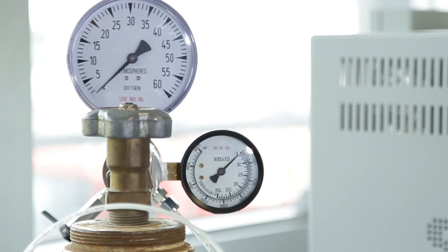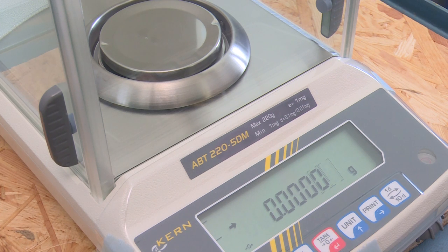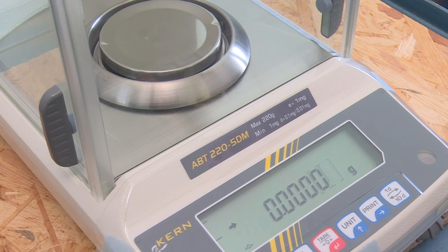The ancillary pressure equipment consists of a pressure regulator to control the filling of the bomb with oxygen, a pressure gauge to indicate the pressure in the bomb, and a relief valve or bursting disk operating at 3.5 MPa and installed in the filling line to prevent overfilling the bomb.